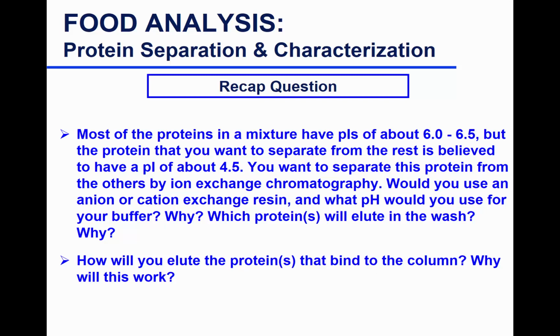Okay. Another way you can do it is to increase salt. Salt will displace your protein on the column and will help the protein move down the column. Okay, so if I ask for one way, you can pick one or the other. If I ask for two possible ways, that would be increasing salt concentration and increasing pH over time. All right, good.